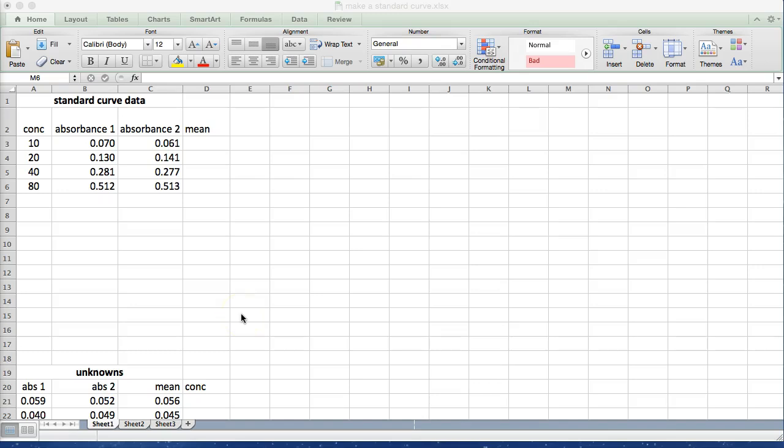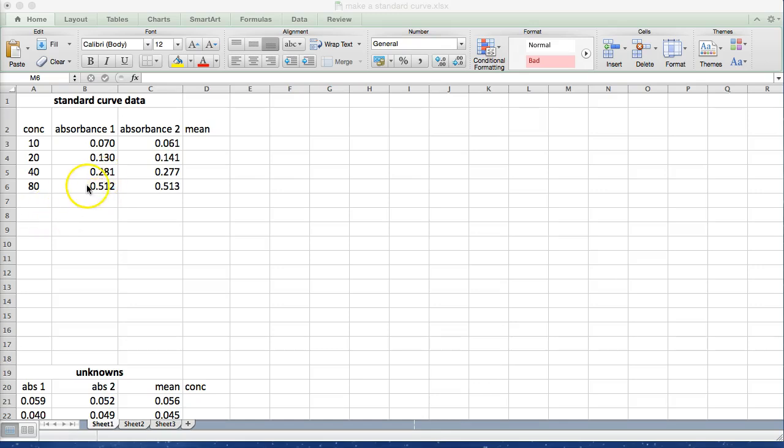So here I've already entered the data for our standard curve. I have the concentrations of A. I haven't included units because those are not important for this example. You of course will have units for your standards. I then measured these standards using a spectrophotometer and I've done everything in duplicate so I have two absorbance values for each concentration.